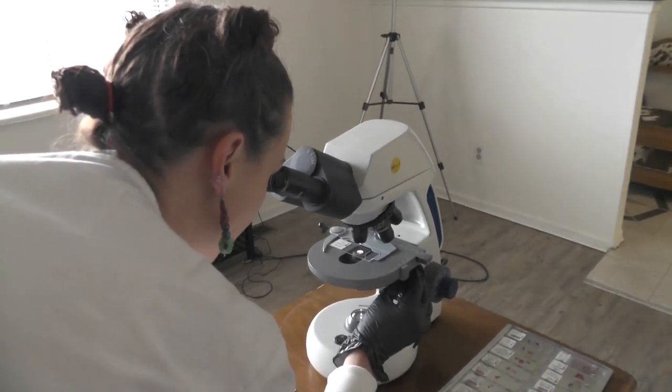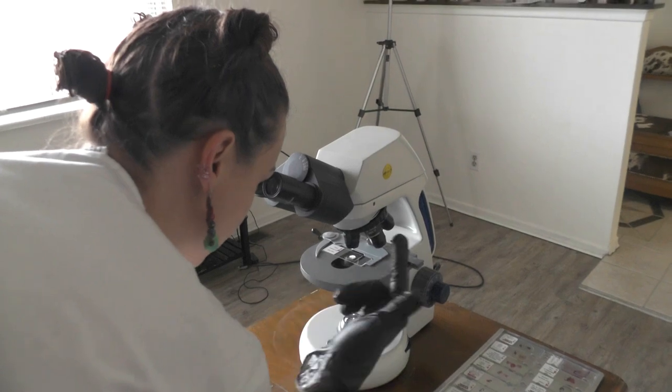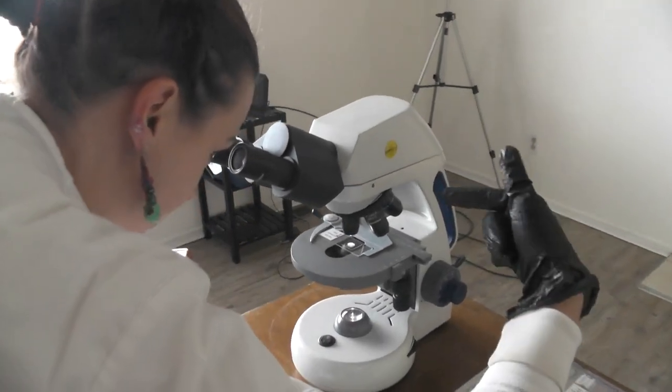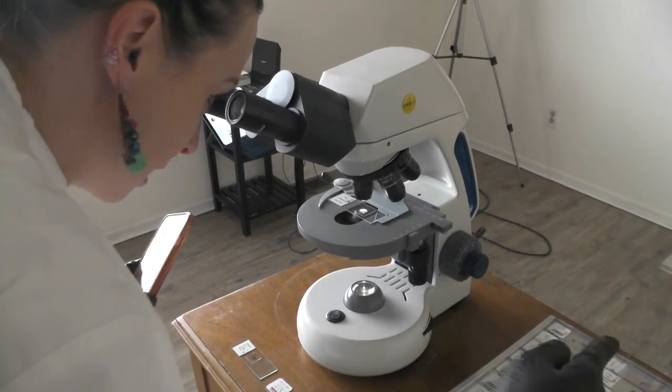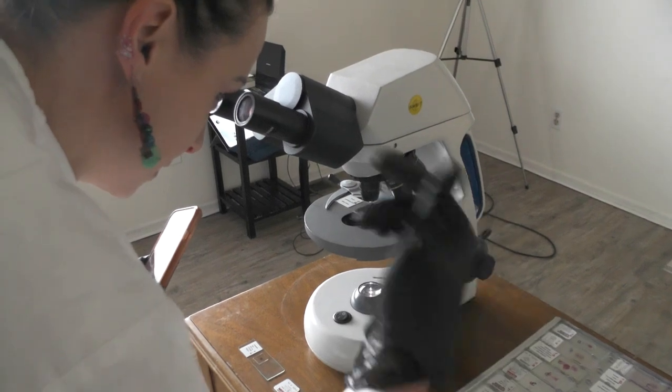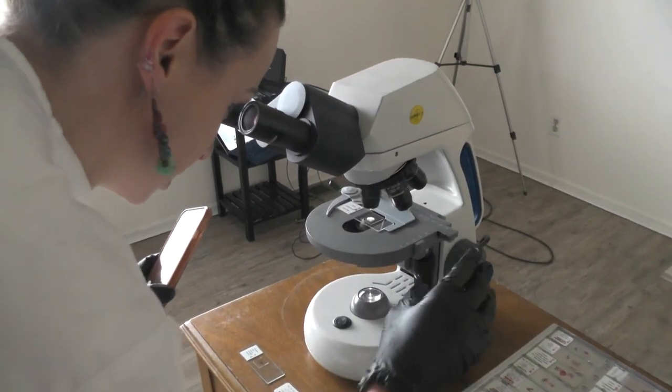I'm actually going to zoom out from this far away because what's really cool in this slide is we can see the epithelium on top with its lamina propria and muscularis mucosae. Then we can see the submucosa. Then we can actually see the inner circular layer of smooth muscle and the outer longitudinal layer.